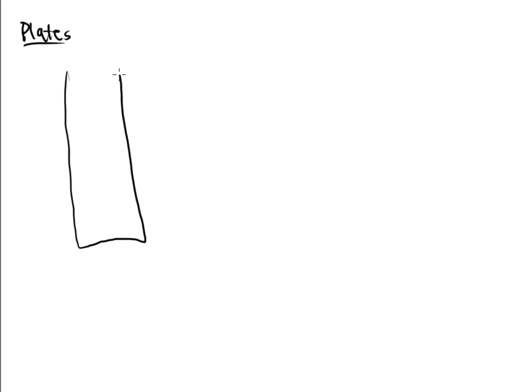All right, so we've talked about plates. We've talked about basically the stationary phases, and we've talked about the mobile phases, and we've talked about indicators that go onto the plates. But at no point in time have we talked about what happens after the spot gets developed, right? Okay, so not too much work is left. Once you develop a plate, and you mark your mobile phase front, and you mark where your origin is at, and this is where you've spotted, and let's say I get a spot that's right here. Now, what do I do with it?